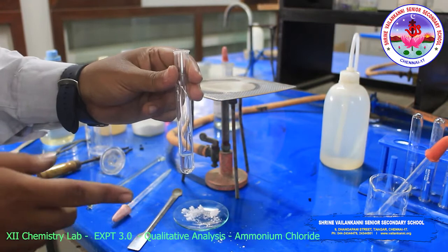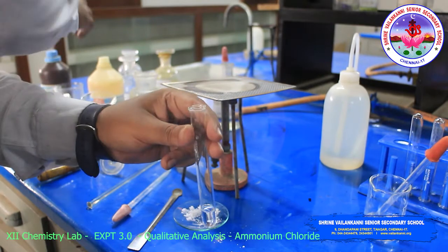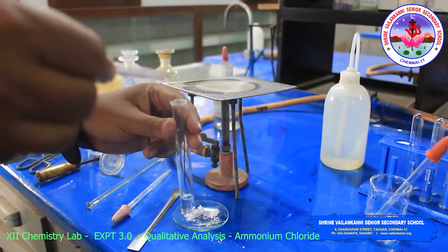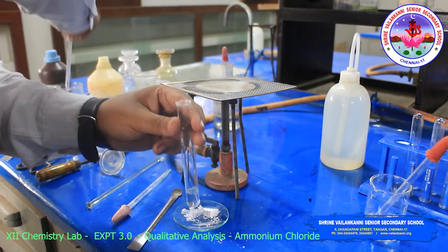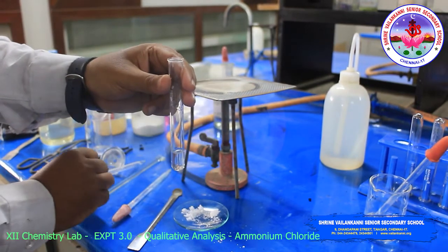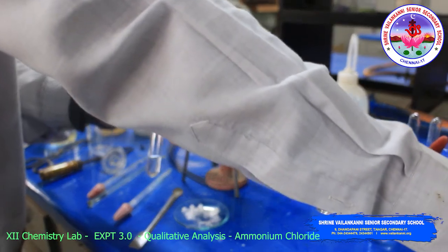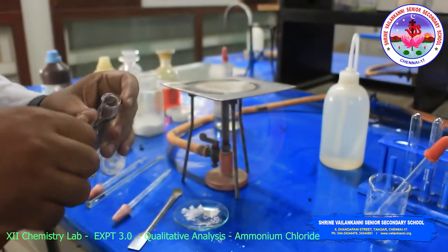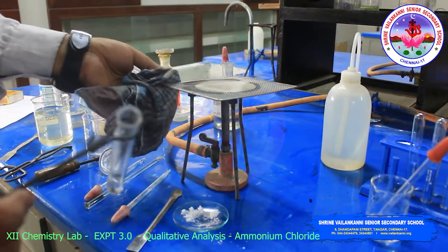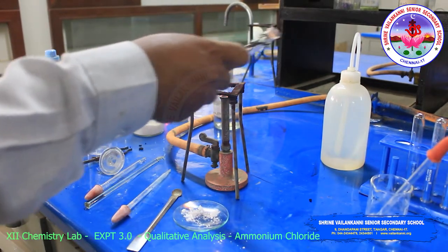Now the original solution, next test is sodium hydroxide test. To the original solution, add drops of sodium hydroxide, then warm the mixture, so the characteristic smell will come.